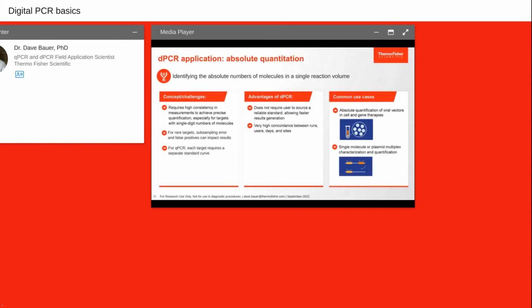And now let's turn to digital PCR for absolute quantification. So if we're doing absolute quantification, generally the need is for some consistent, precise, and accurate quantification of our target. And for all those reasons we just mentioned, all those drawbacks with real-time PCR, digital gets around those because, again, it's a direct measurement. There's no standards that we're comparing to. We're directly assessing concentration.